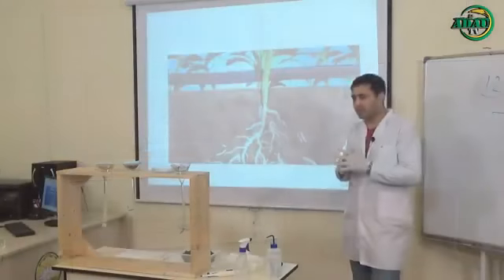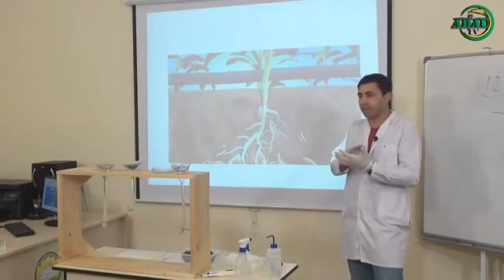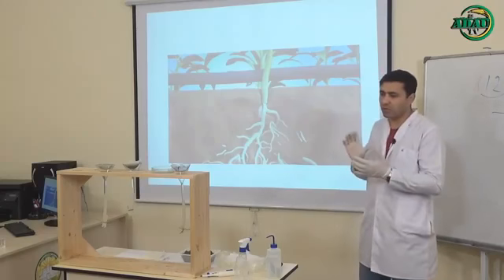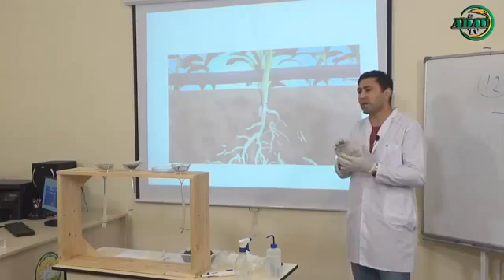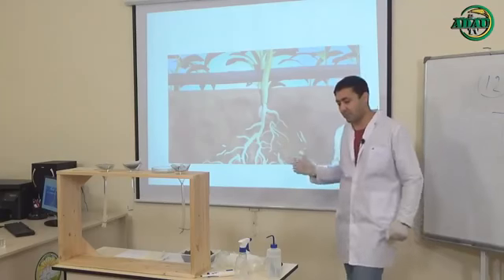Without analysis, we can never diagnose directly. Okay, we can tell something, give some idea, and offer our suggestion. But at first, you have to search all this information, all these plants, all these samples, under the microscope or in laboratory conditions, which I showed you and explained to you.